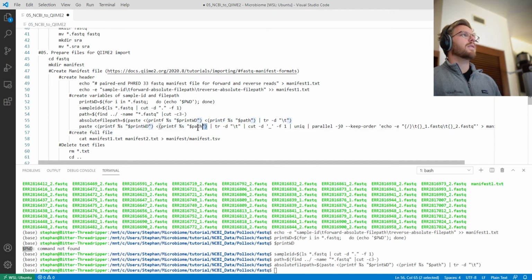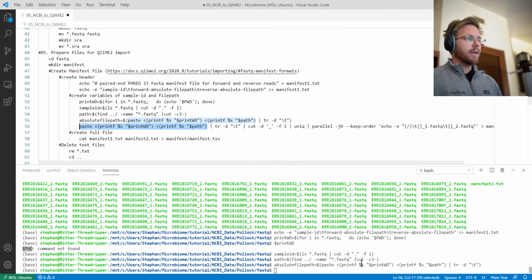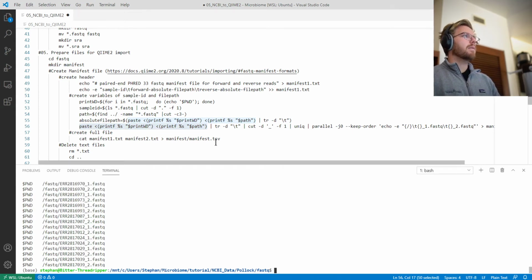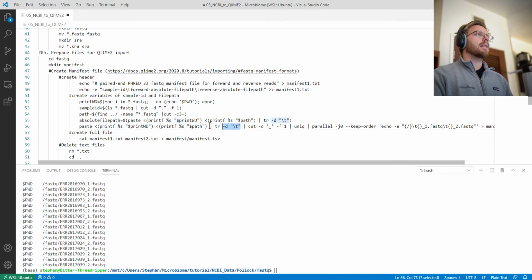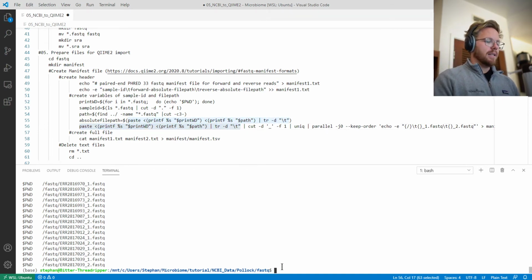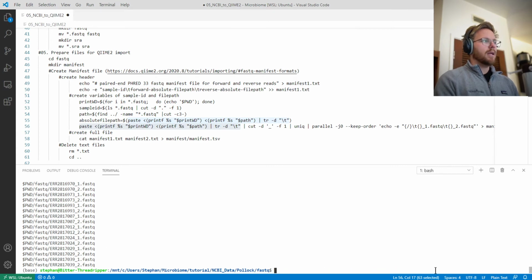So I'll just show you what this output is to make this a little more clear. So here we go, this is the output. Now if I add this second line with the tr delimiter being a tab value, that's what this is, tr -d, then a tab. It got rid of the tab, so you can see that there.